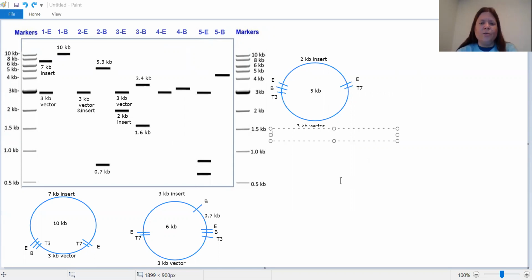Okay, so what we've got now is consistent with our EcoR1 lane, and we've got all the features of the vector. But again, we see there are 2 bands in the BamH1 lane, so BamH1 must cut this plasmid twice, and the other site, once again, has to be in the insert because we know it only cuts the vector once. So there's got to be a BamH1 site 1.6 kb away from this, so that would be sort of over here, which we'll label as BamH1.